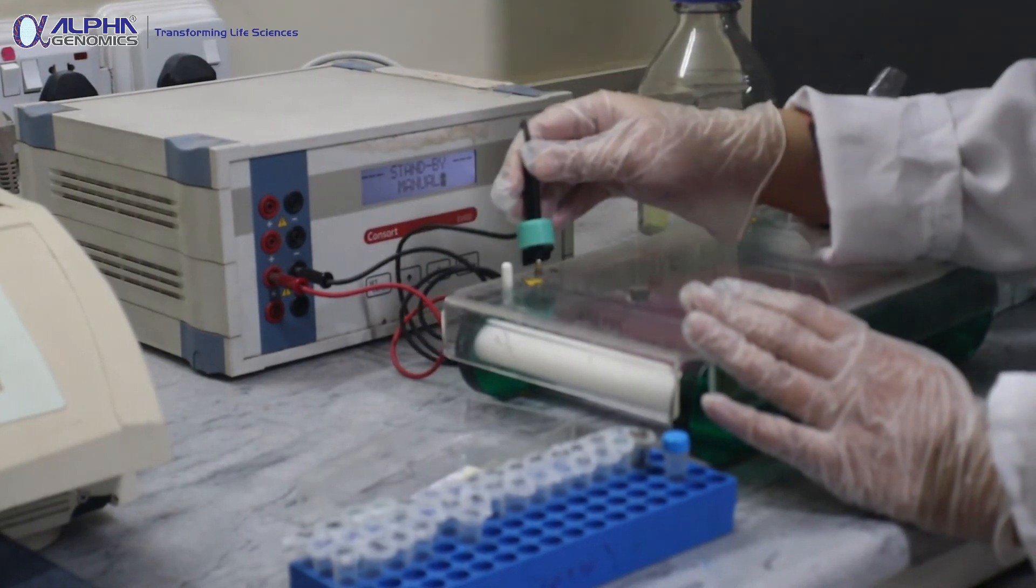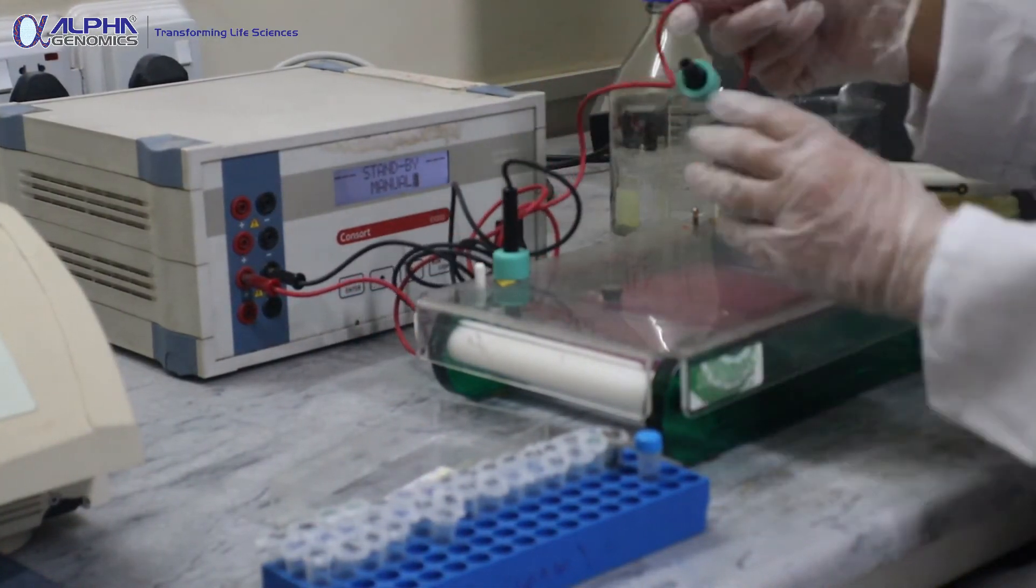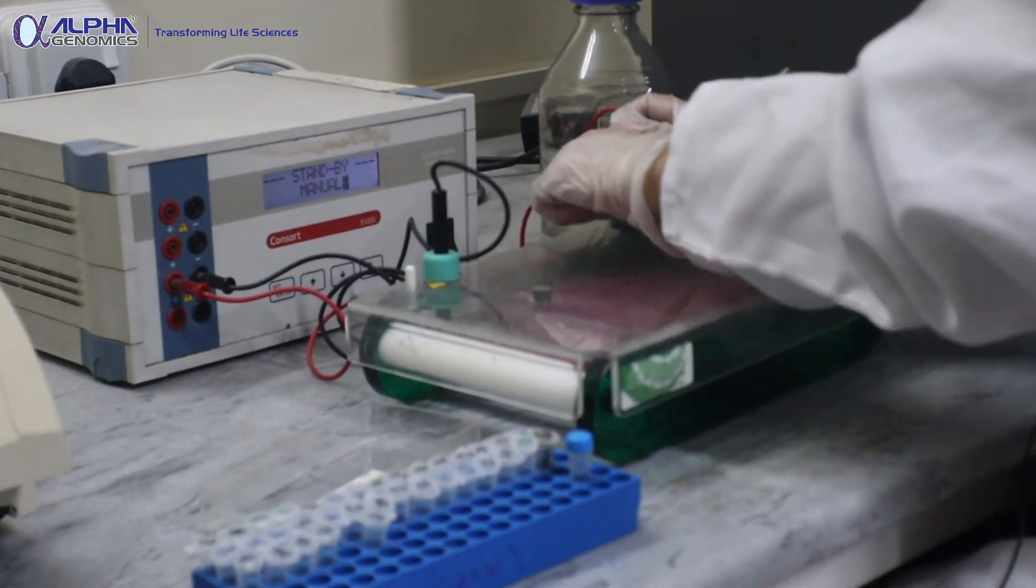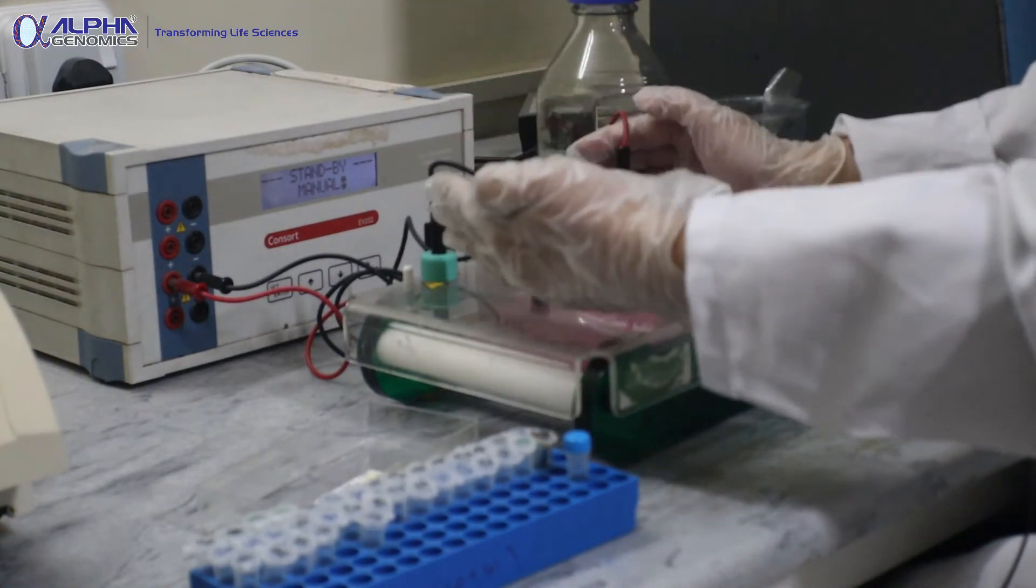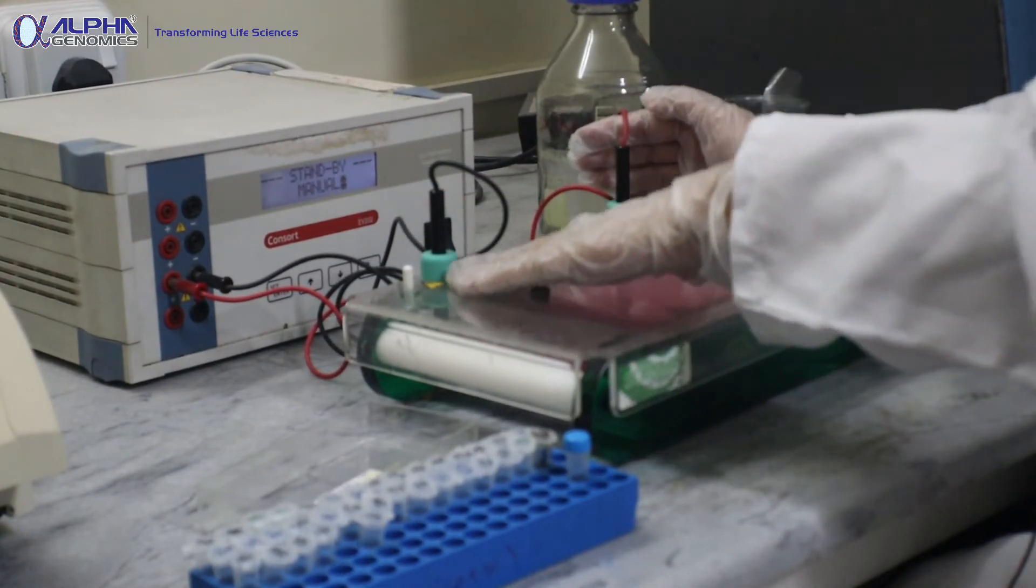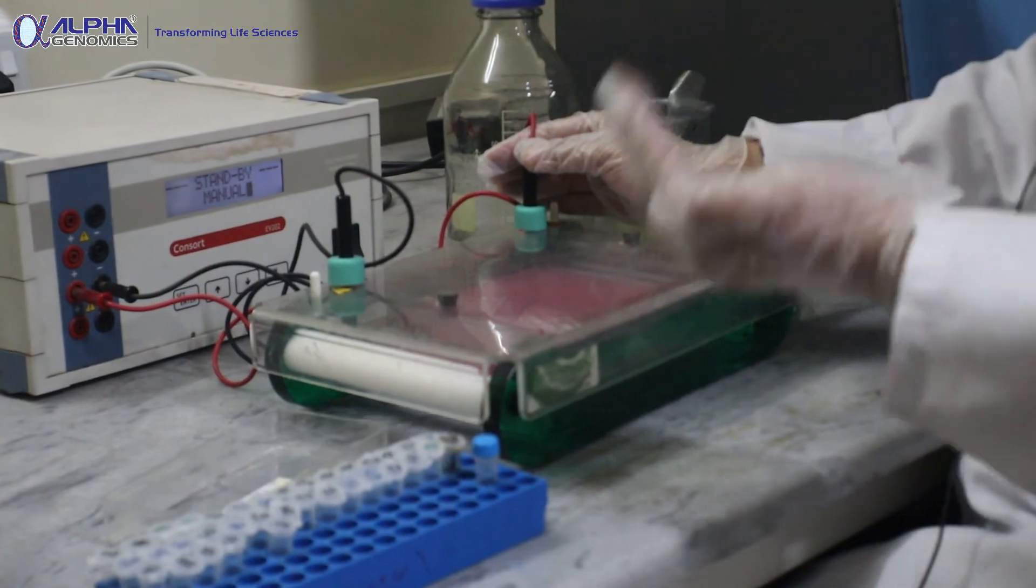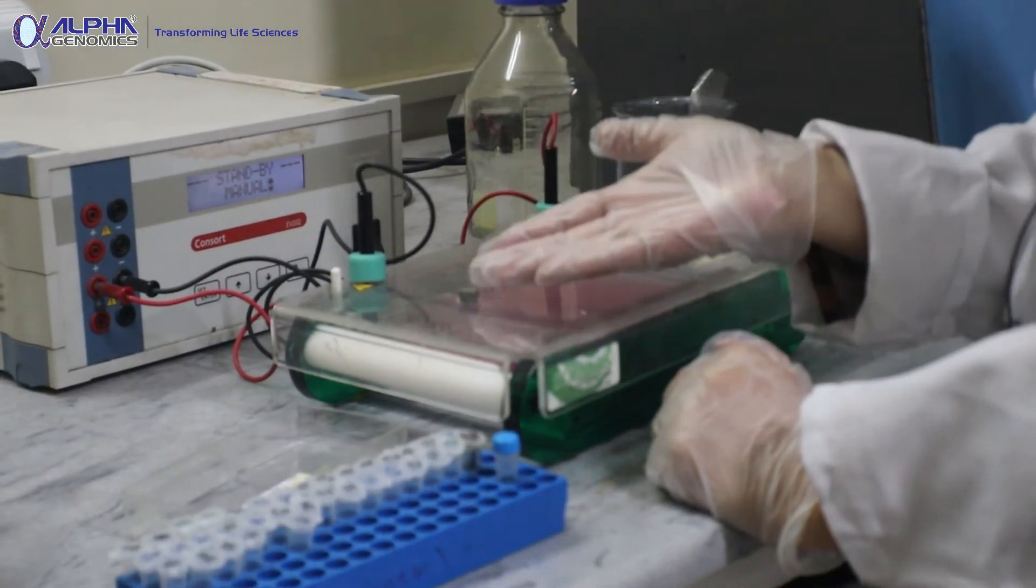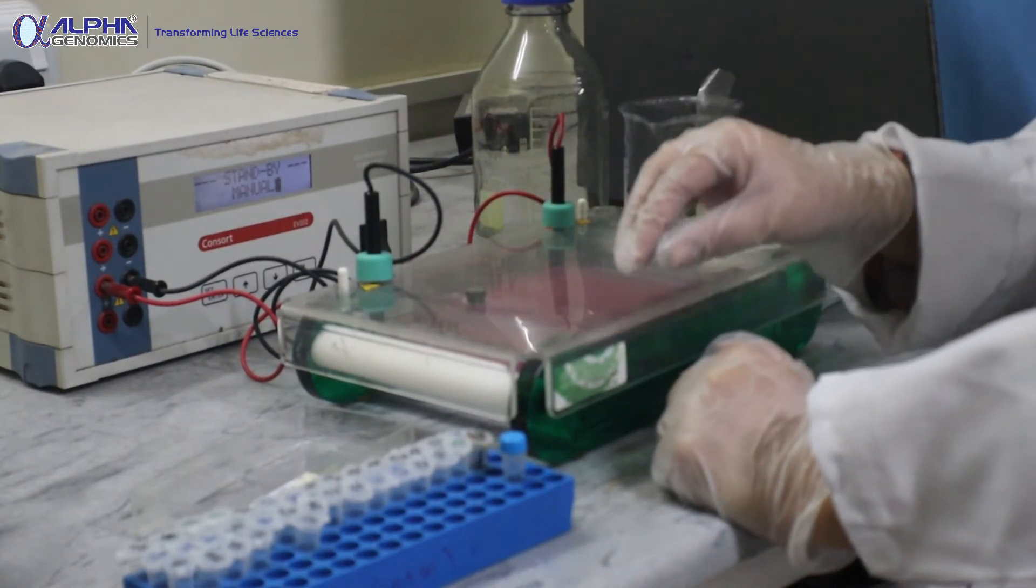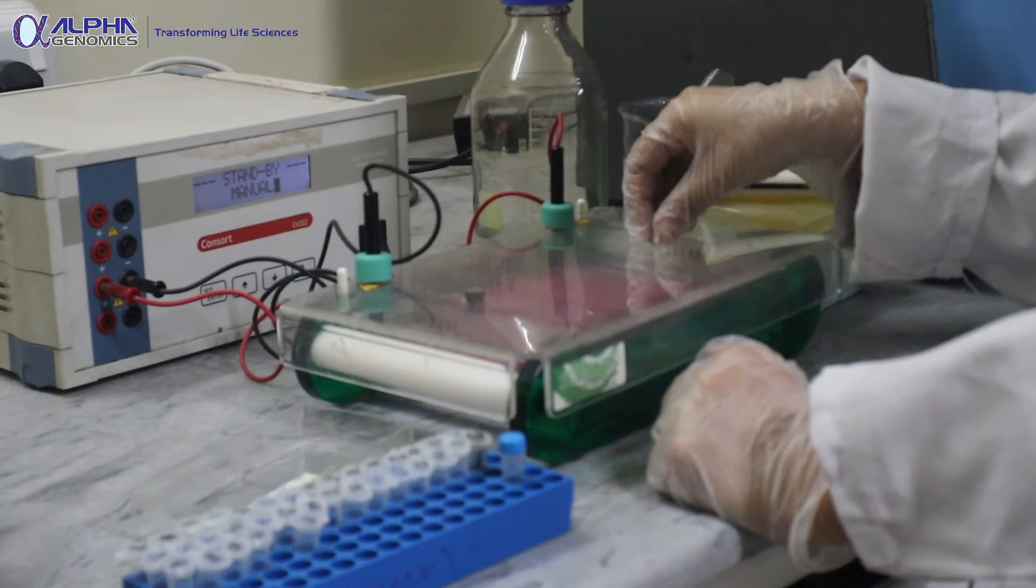The black color power terminal is used for the negative charge whereas the red color is used for the positive charge. Each of these electrodes are connected to their required position. If you are connecting the negative region over there, that means the DNA will move from the negative terminal towards the positive terminal as per its charge ratio. DNA is negatively charged so it will move across the gradient of charges. The function of the buffer is to provide ions for the movement of these DNA molecules across the gel, and the current is being provided by this power supply.